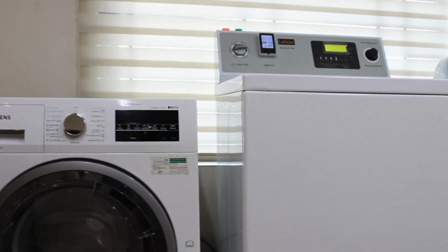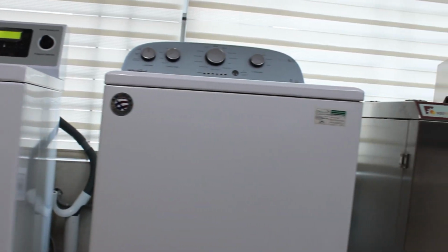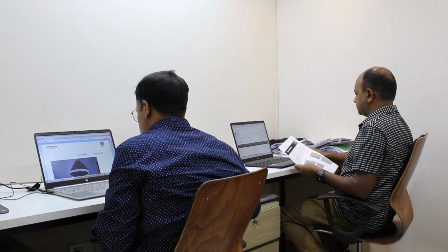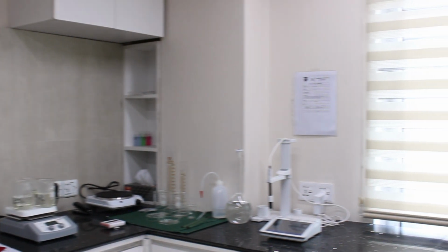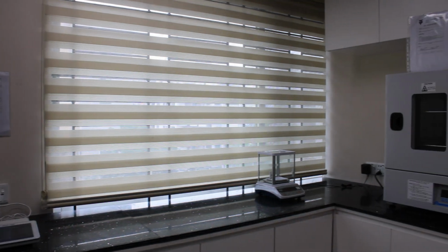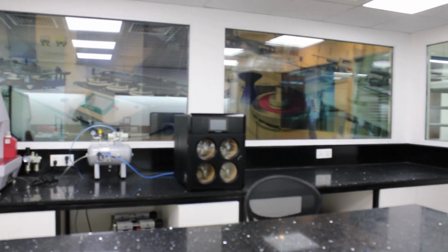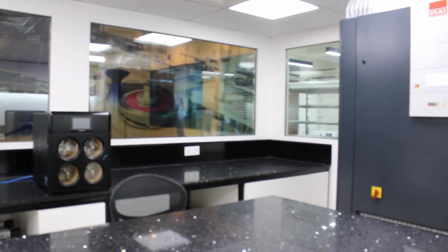Lab testing is an essential part of production and product development, ensuring products meet the highest quality standards. It catches defects early and identifies potential hazards in fabrics or garments, helping companies provide consumers with safe, reliable products. Most importantly, lab testing helps protect brands and retailers from costly recalls or product liability claims.